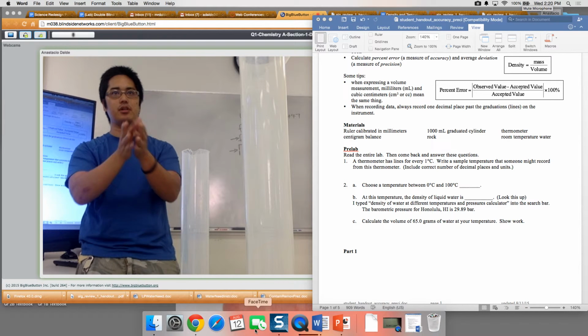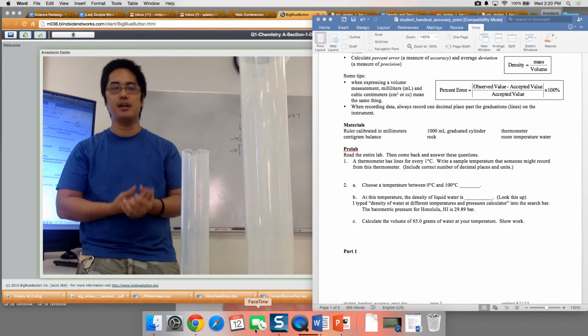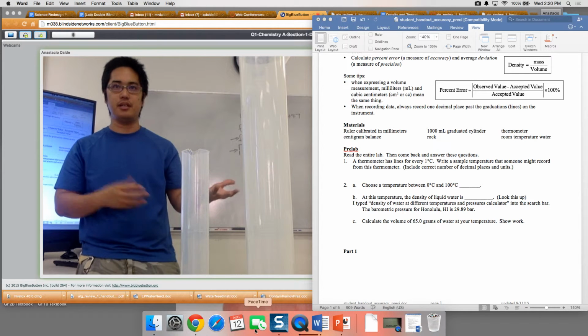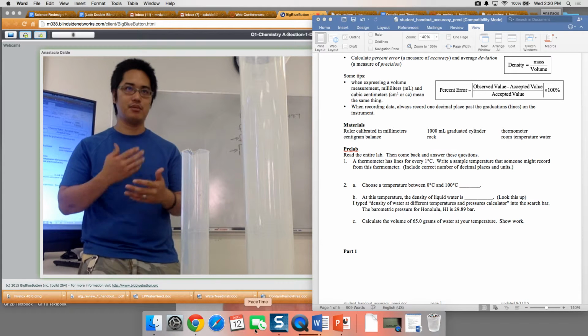I'm going to record just kind of a demo for you to show you folks what you are going to be doing in this lab. I want you to conduct this lab. Try to be clean. It's got a lot of water that we're going to be using, and I don't want you to spill stuff. And also clean up after yourselves. That's super important in this lab.